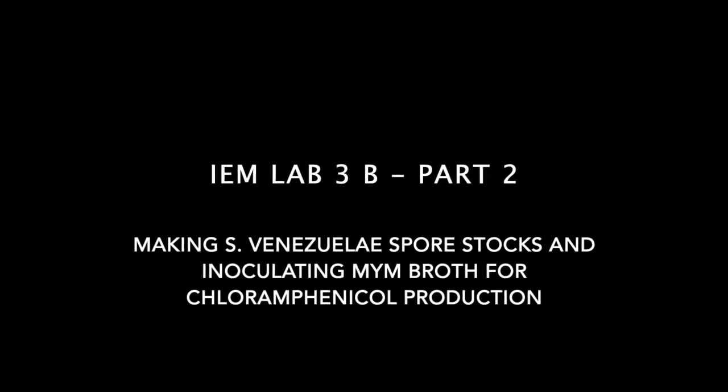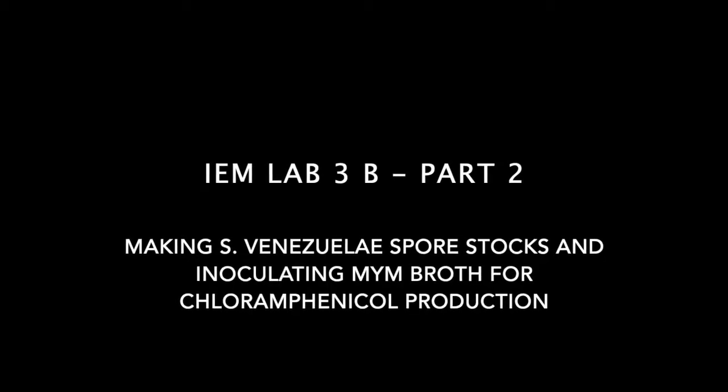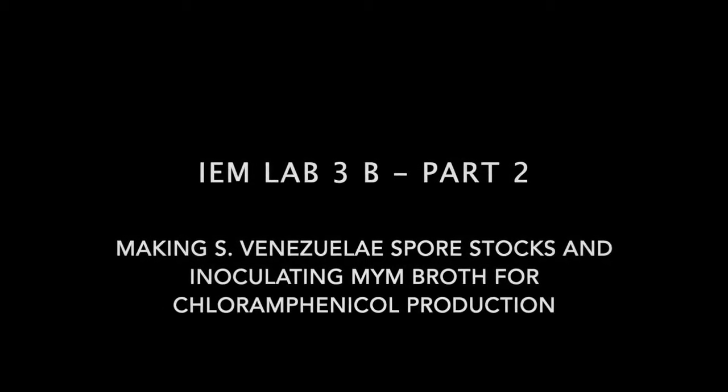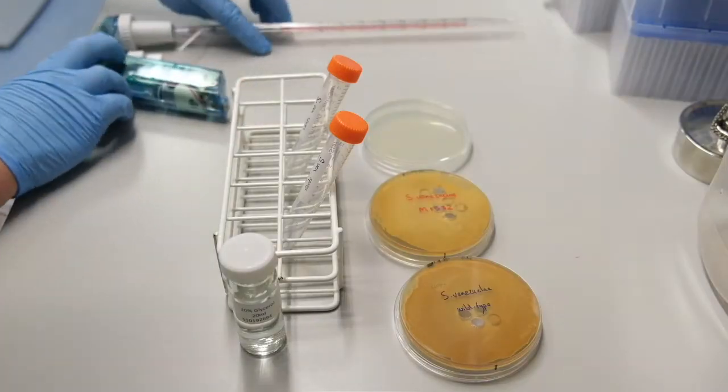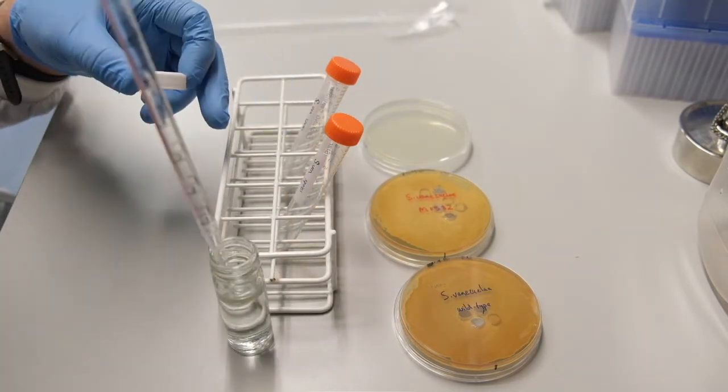In this video we will be making Streptomyces venezuelae spore stocks and inoculating liquid cultures for chloramphenicol production. We will collect spores from MYM agar plates that have been incubated for 5 days at 30 degrees.